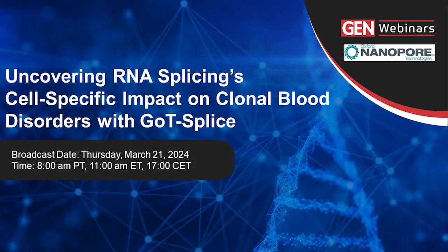During the webinar, you'll hear a case study where GoT-Splice was used to study hematopoietic progenitors from MDS patients with mutations in the splicing factor SF3B1. And you'll also hear about the findings that collectively demonstrate the power of GoT-Splice in delineating the cell type specific impact of somatic mutations on RNA splicing.